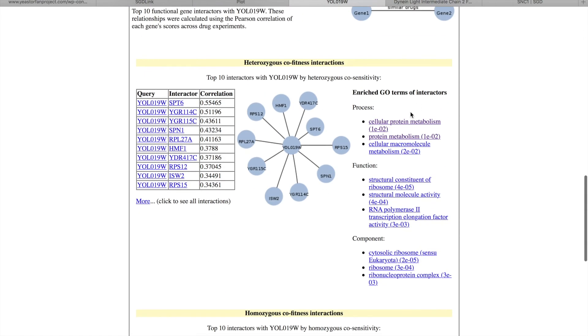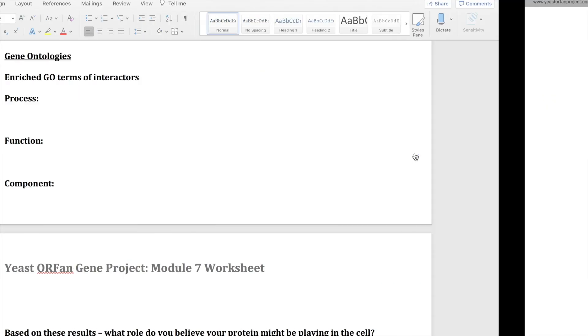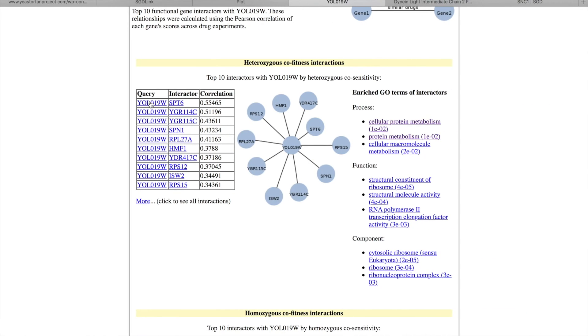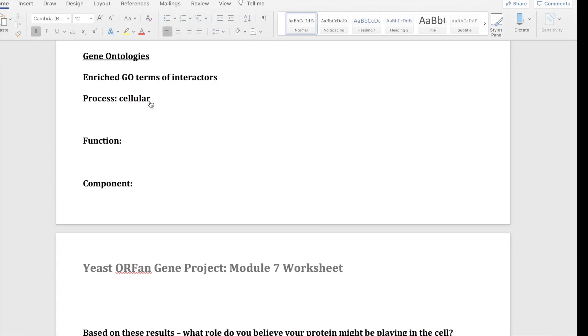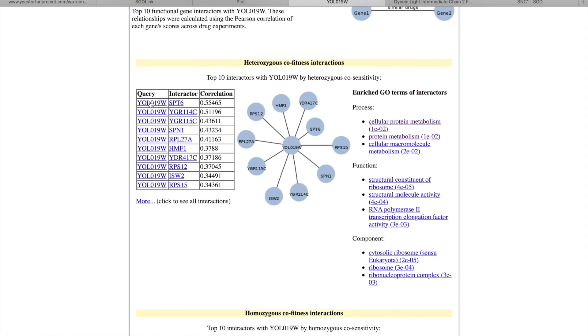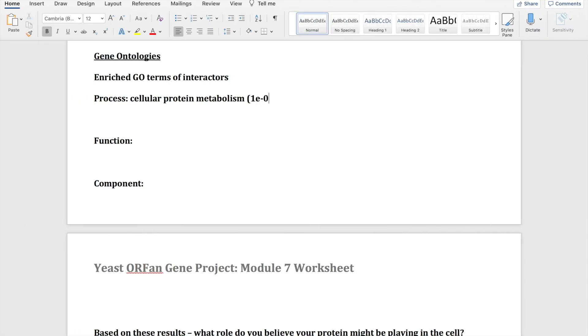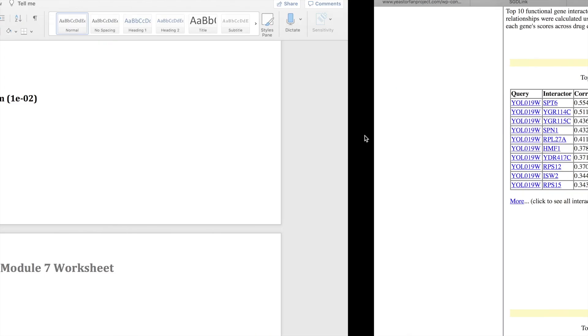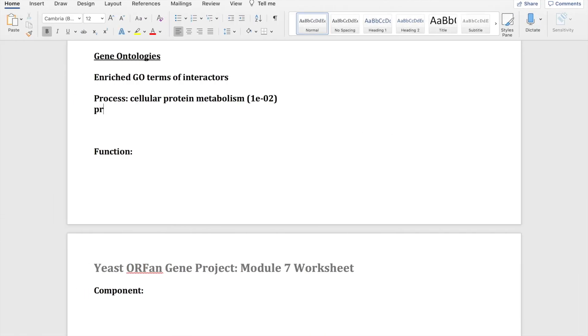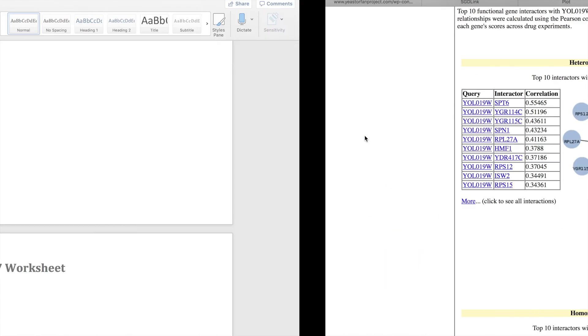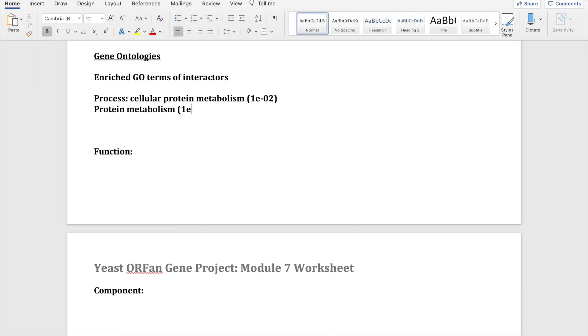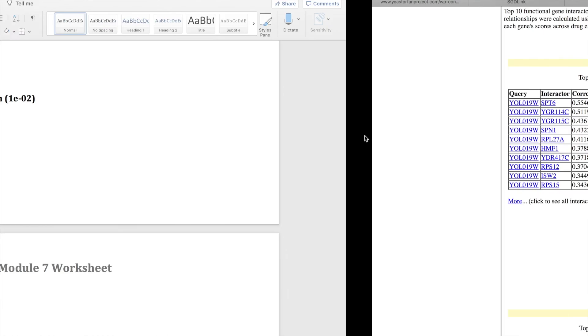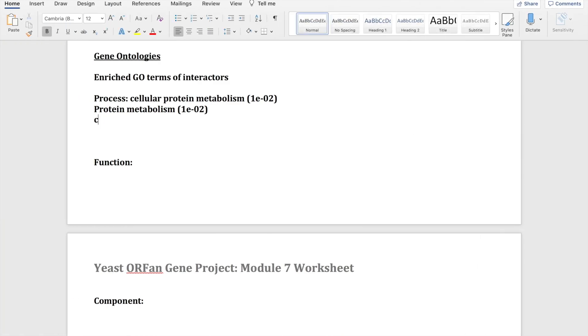So for this one I don't have any enriched GO terms, so I'm just going to use the heterozygous enriched GO terms for example. So you would just copy down all the ones for process. So cellular protein metabolism, protein metabolism, and the cellular macromolecular metabolism.